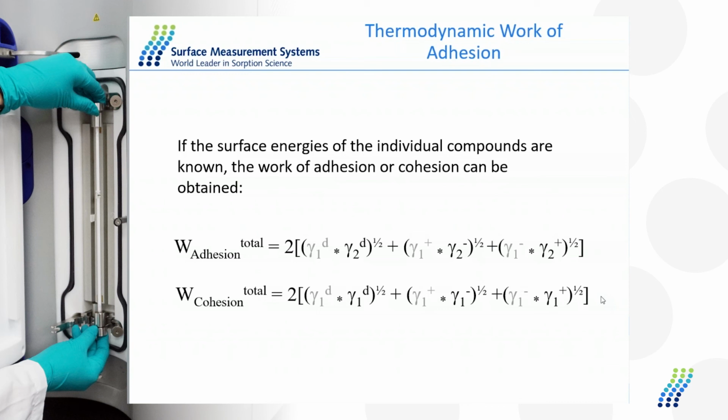There is some method development that would apply, but if you're looking at surface energy of powders, I would typically recommend, we try to get about a half meter squared of total surface in the column, and using C7 to C10. If you're looking at low surface area materials, you would want to use higher alkanes, and vice versa for high surface area materials.